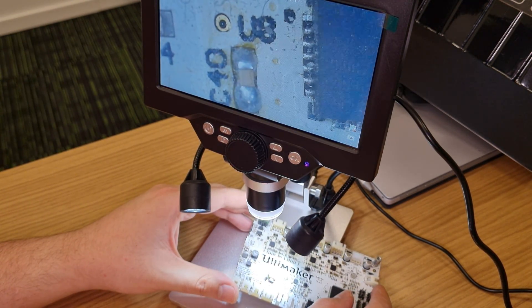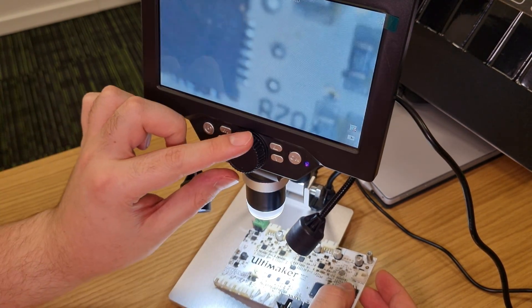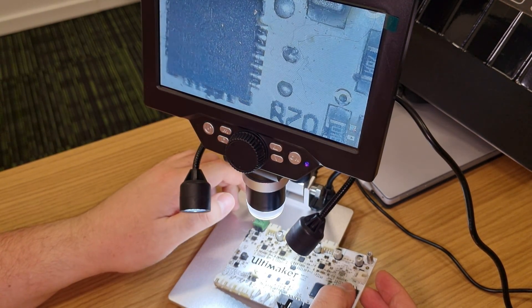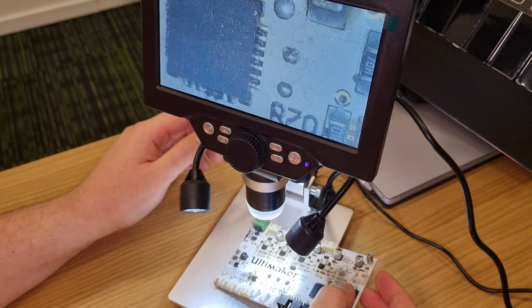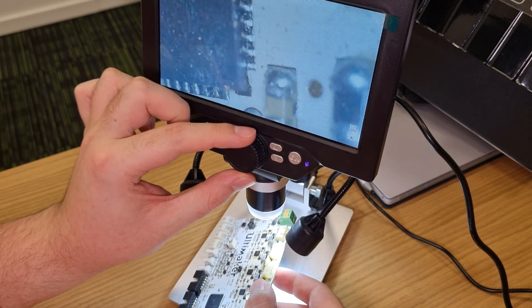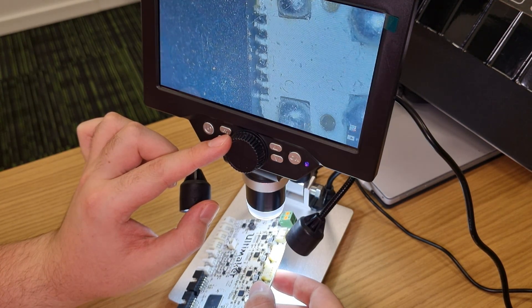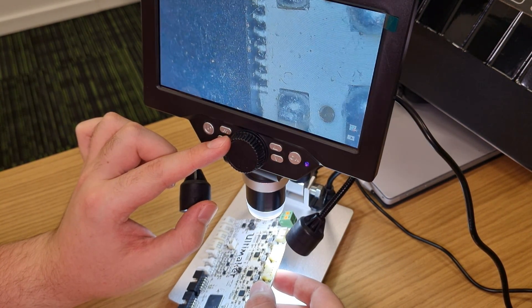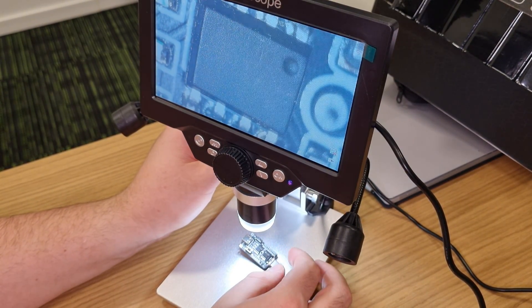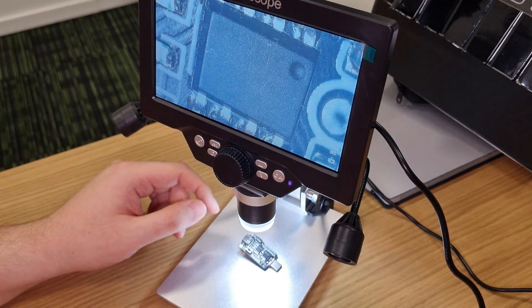I don't see any short circuit on this side. The soldering looks perfect and yet it failed. Let's check the top side — it's dirty but it should work. I don't see any short circuits there either. The traces are aligned and the chip looks clean — it's okay.